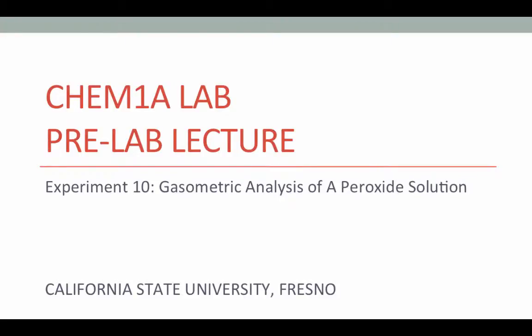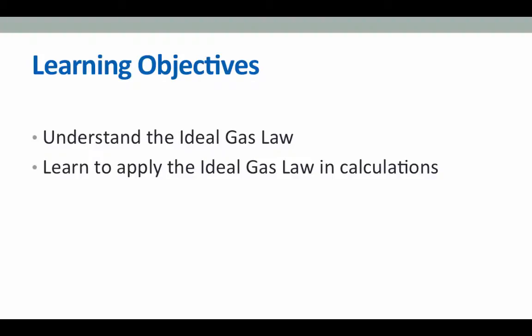Hello and welcome to the Chem 1A pre-lab lecture for Experiment 10, Gasometric Analysis of a Peroxide Solution. Today's lab focuses on the ideal gas law, and we hope by doing this experiment that you will come to understand the law and learn how to apply it in calculations.